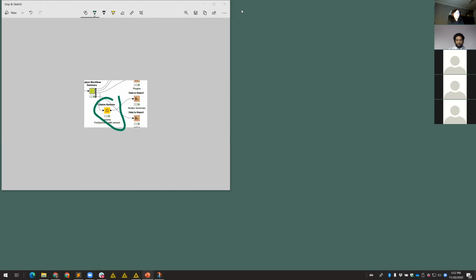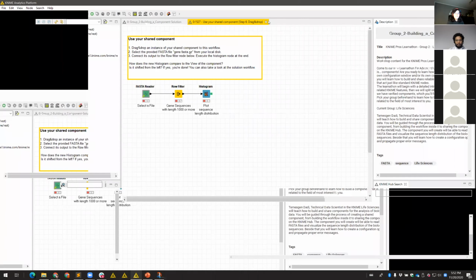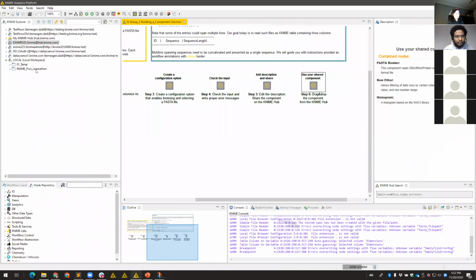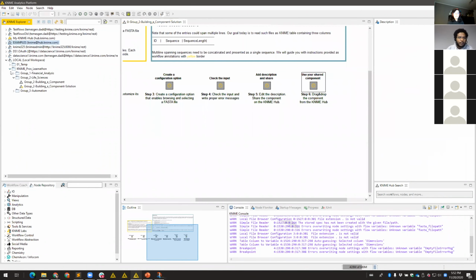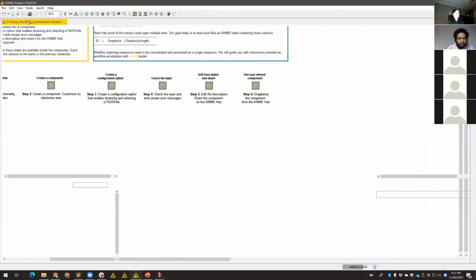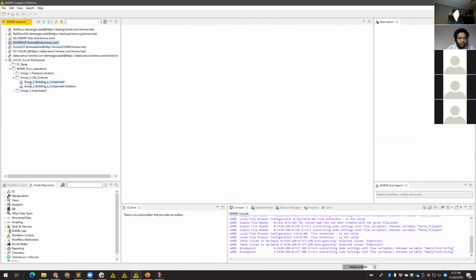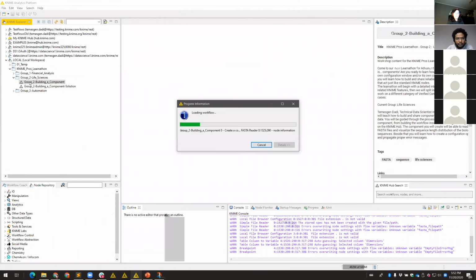Now I'm going to share my KNIME Analytics Platform. This is the solution, and this is the exercise.